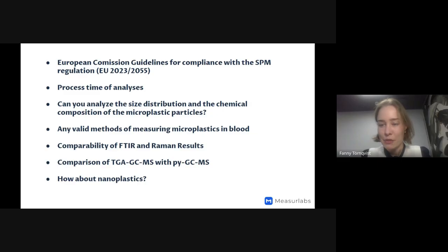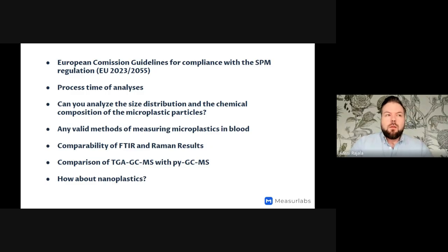Then we have a question from Dora about sample volumes, asking what volume of wastewater or mass of sludges do you need to perform the analysis? For wastewater, I would say it depends a bit on the type of wastewater.